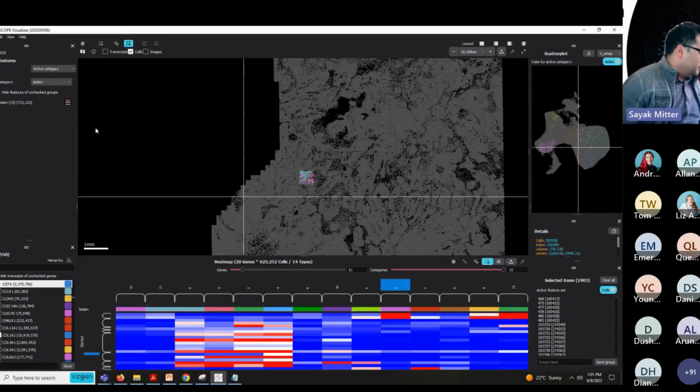Yes, I think a link will be provided at the end of the webinar for this, and thank you for your interest. I hope I was able to cover most of it. The software is accessible for any MERSCOPE user. You are able to access it free of charge, and you can install it on your Windows or Macintosh platform.